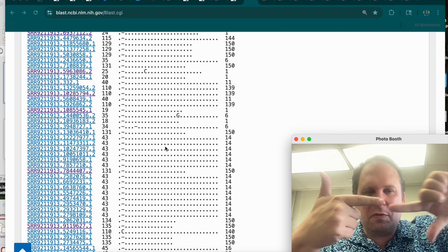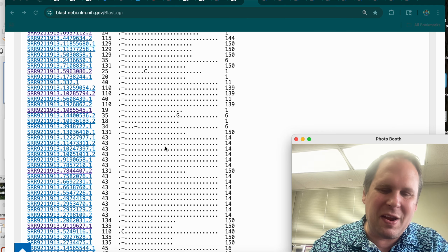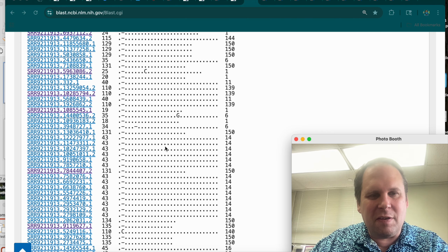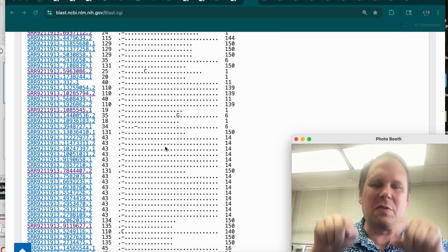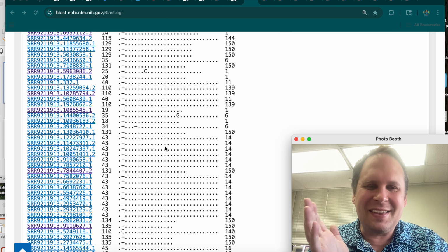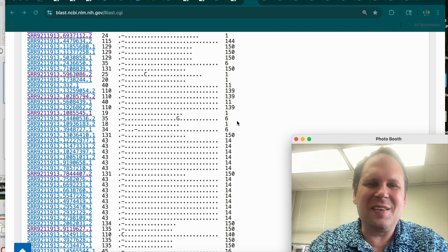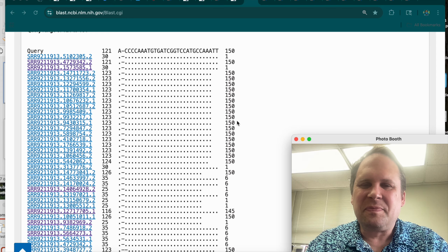So we know that the reverse read is somewhere over here, and we'll extend our sequence in the way we're trying to extend it. We're trying to make the front grow more toward the front, and the back grow more toward the back. Rewatch or try the example, see if you can match mine. It takes a minute to get your head around that, and that's okay. But you need to get your head around that, otherwise it's just so slow.